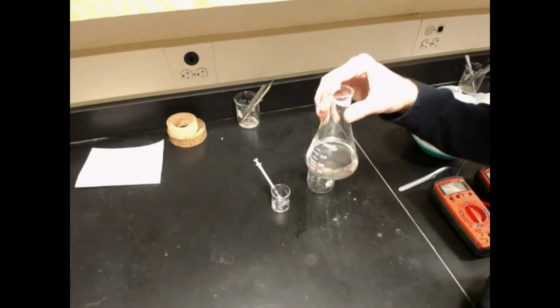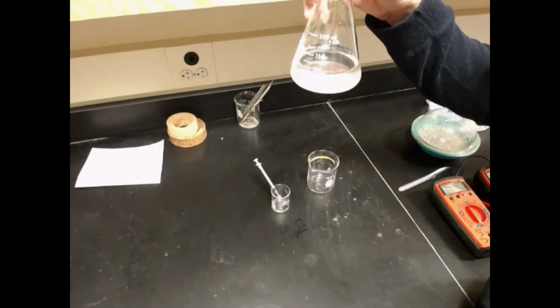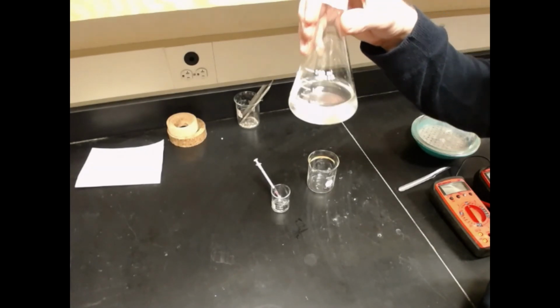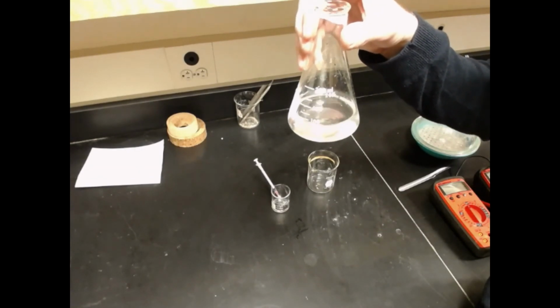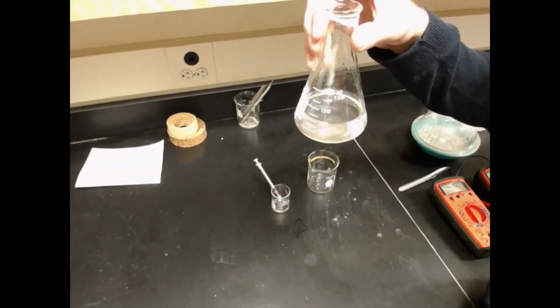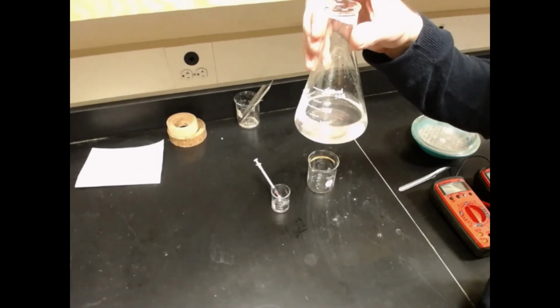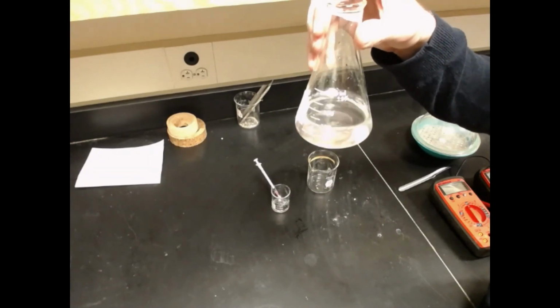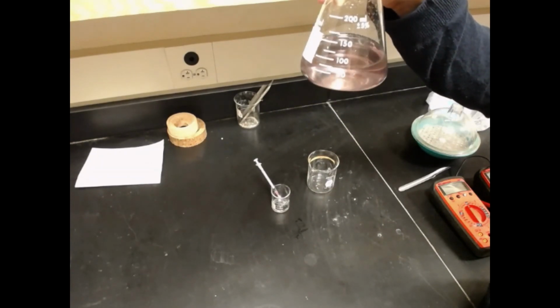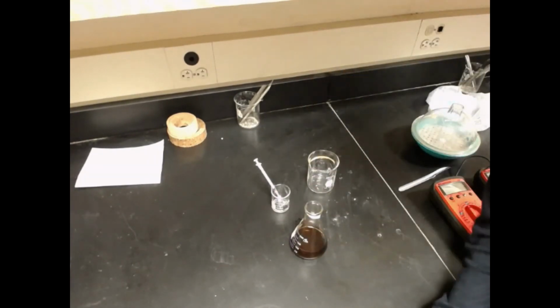But you have all the data from experiments where it was done multiple times. Again, the goal of this is to see how long it takes to use up the thiosulfate, because that tells us how fast the persulfate and iodide react. The nice part about that second reaction, the thiosulfate and iodine, is that it's a very fast reaction. So what we're limited by is the reaction that we actually care about, the persulfate and iodide reaction. And there we go, color changed again. You would repeat that more times, but that is how the experiment would look.